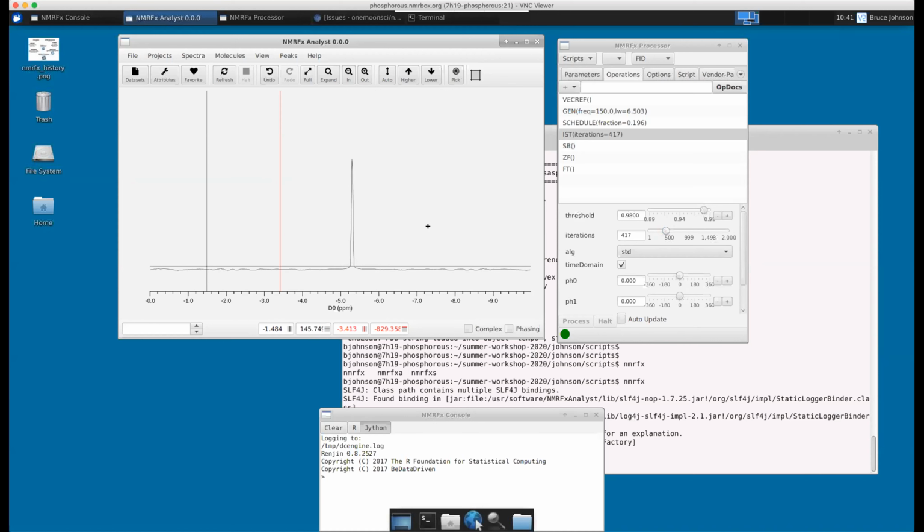Okay, so it is a forward, inverse. Yes, IFT, FT, back and forth exactly. And that's fundamentally why it takes so long. It's very quick here in my simple example in 1D, but you're doing exactly the same thing in 2 or 3D. And if you're doing a 4D experiment, in the indirect dimensions you're having to do hundreds of 3D forward and backward transforms. Oh, great, that's pretty clear.